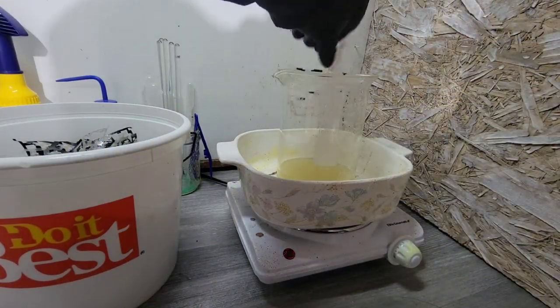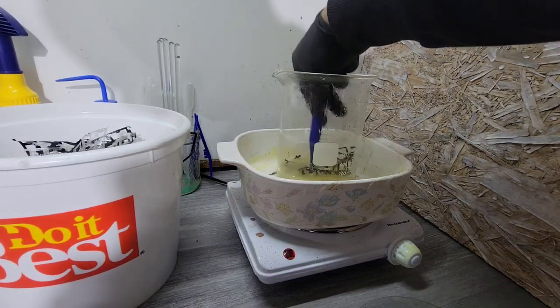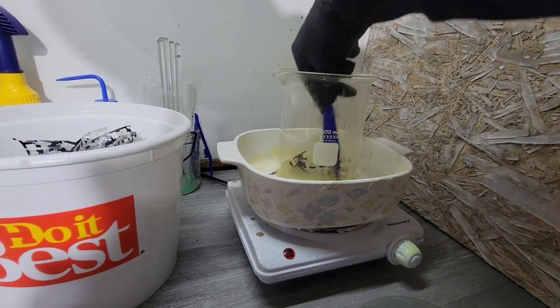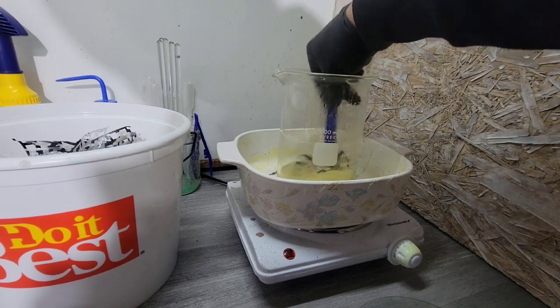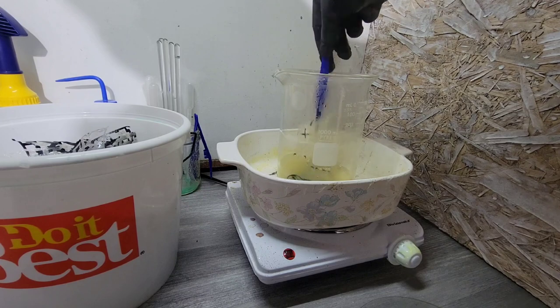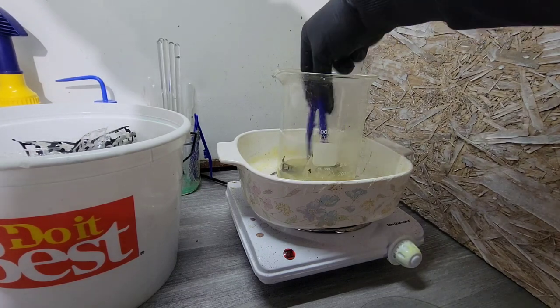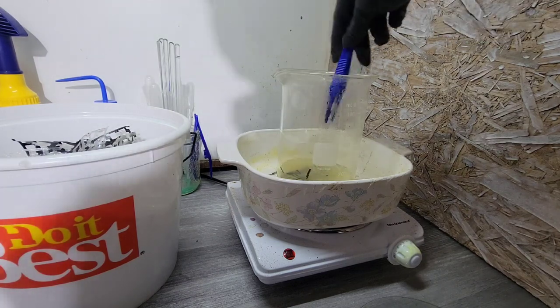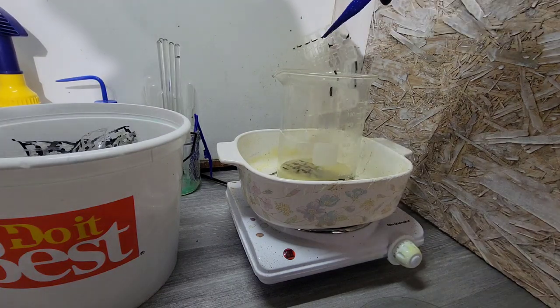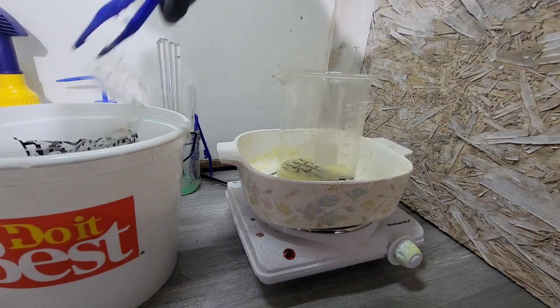Alright, down to my last two. I found that once they get warm, they turn pretty malleable, so you can put three or four of them in. This is a 1,000 milliliter beaker, so I was able to successfully do three or four. Five gets a little much. You need a little more fluid. By the time this has evaporated, I'm down to 200 milliliters of solution total. And like I said before, some of it's being carried away too.